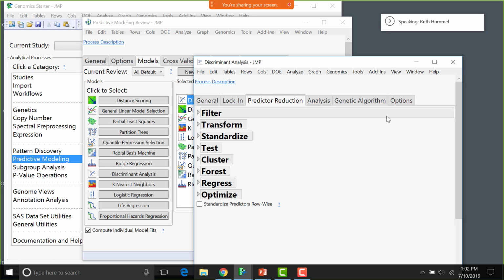Great, Ruth. So just a few questions. Here's the first. What equation or prediction is the software using to predict the phenotypes of the progeny? Yeah, that's going to be just whatever models you're choosing here. So if you choose like a ridge regression, it's going to use that methodology to do the prediction. So you'll build the predictive model and then you'll use that for the progeny simulation.